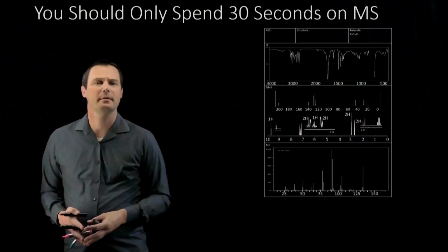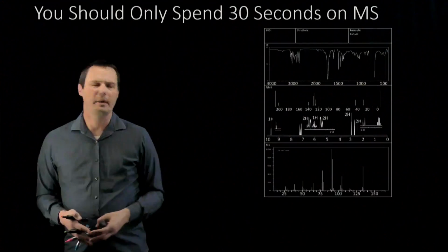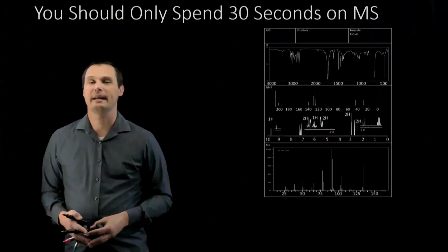I also think you should only spend about 30 seconds on IR, but I've got a separate video on that down below. What do I mean you should only spend 30 seconds on mass spec? Isn't there so much information in there? Yes, but not all of it is diagnostically useful.